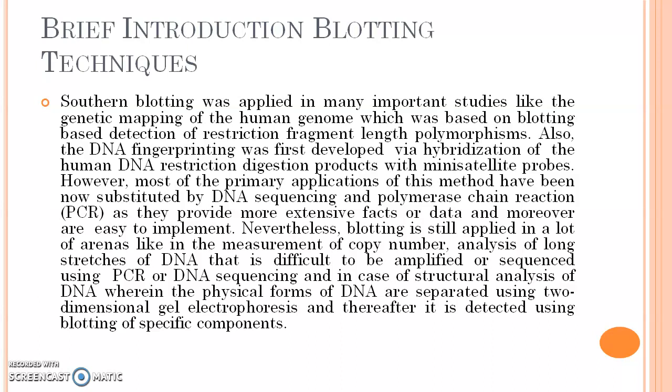Nevertheless, blotting is still applied in a lot of areas, like in the measurement of copy number, analysis of long stretches of DNA that are difficult to amplify or sequence using PCR or DNA sequencing, and in the structural analysis of DNA, wherein the physical forms of DNA are separated using two-dimensional gel electrophoresis and thereafter detected using blotting of specific components.